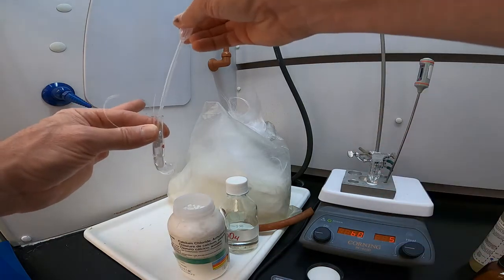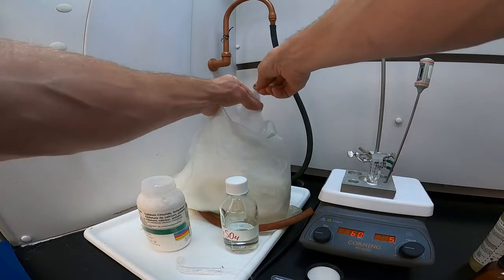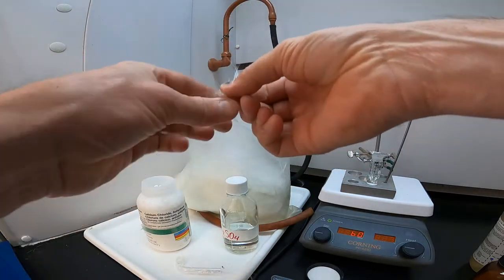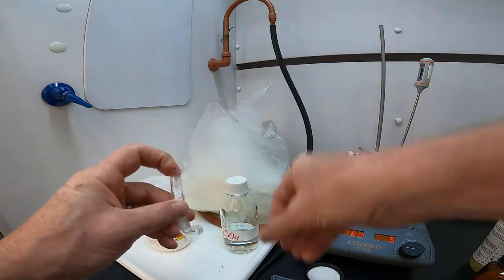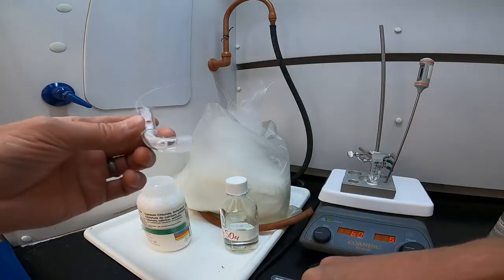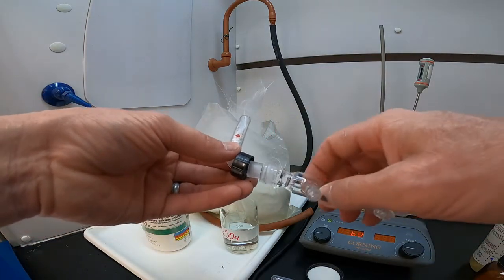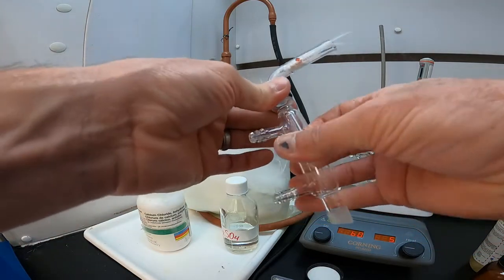So the glass wool is just there. It'll be a little bit on both sides to keep the calcium chloride beads and pellets contained inside that tube. Doesn't have to be pretty. It just serves the purpose of holding the materials in place. So that will attach directly to what's called a water-jacketed reflux condenser, and I'll explain that.